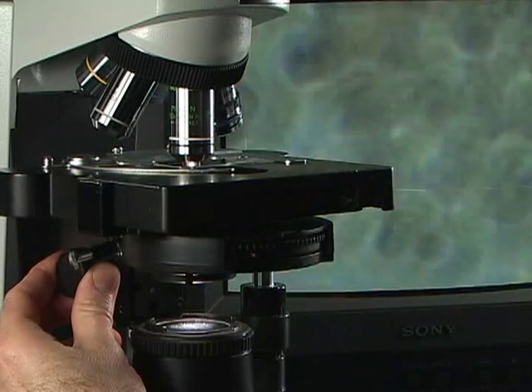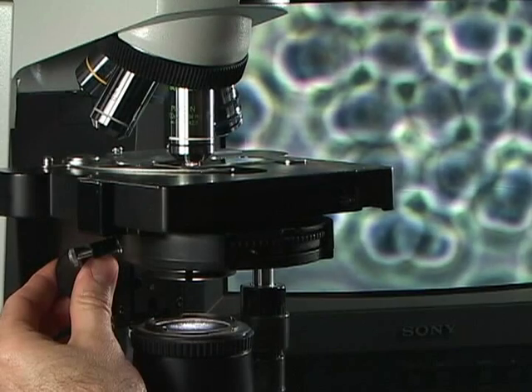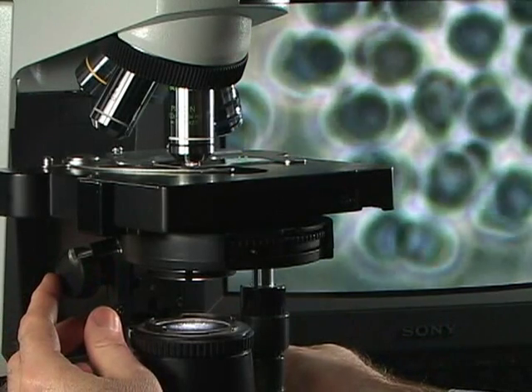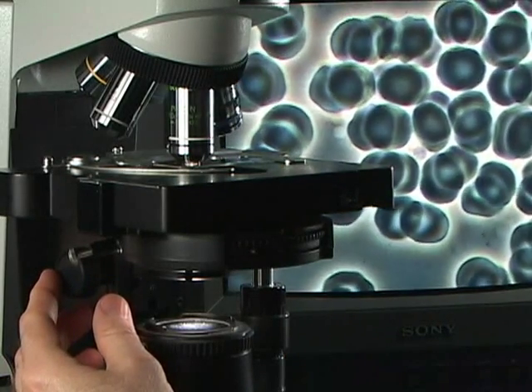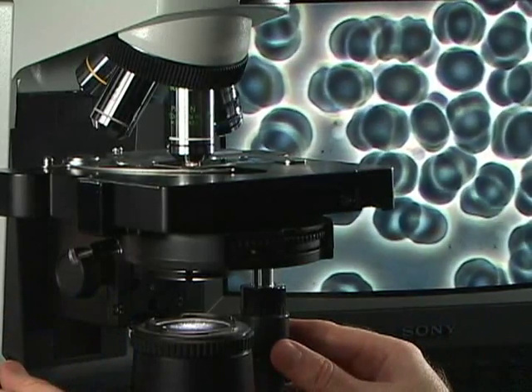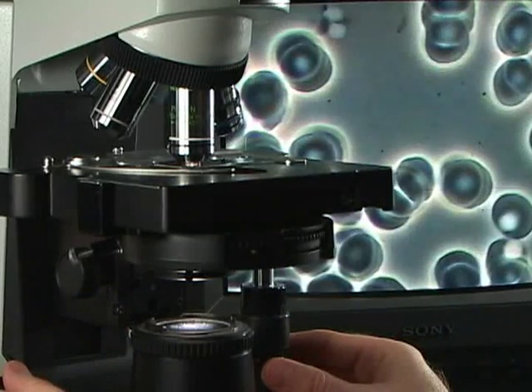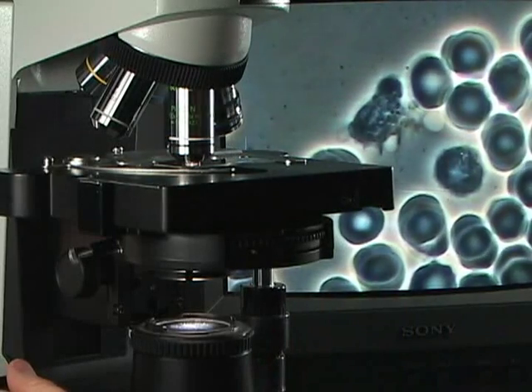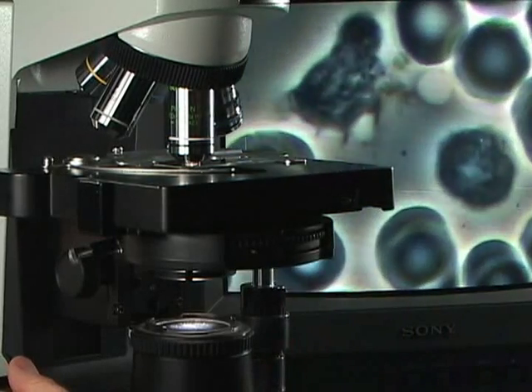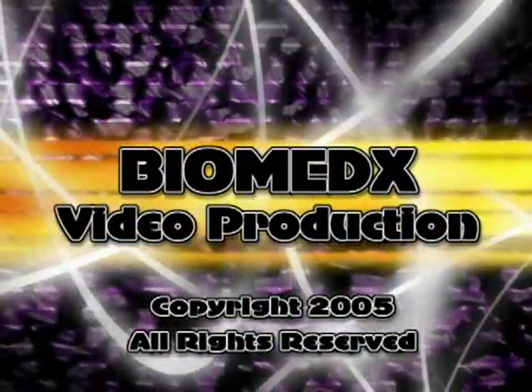Now I move up my condenser. The oil from the bottom is going to hit the slide, and I will need to focus. I certainly don't need to be zoomed in anymore, so I'll zoom out all the way. And now we've got our oil perspective — more magnification and higher resolution. And now we're going to focus.